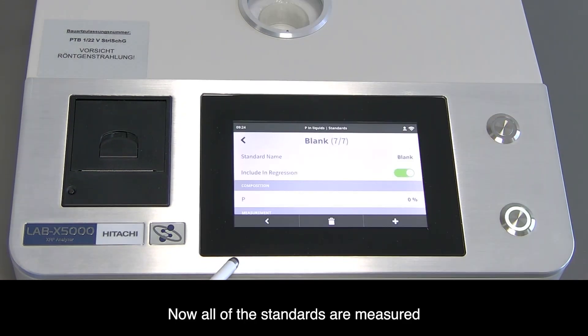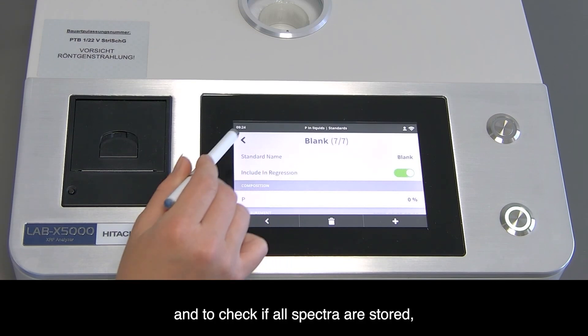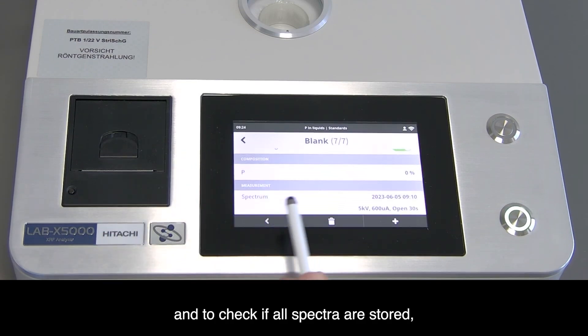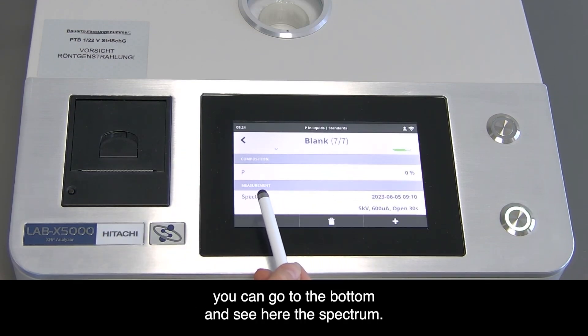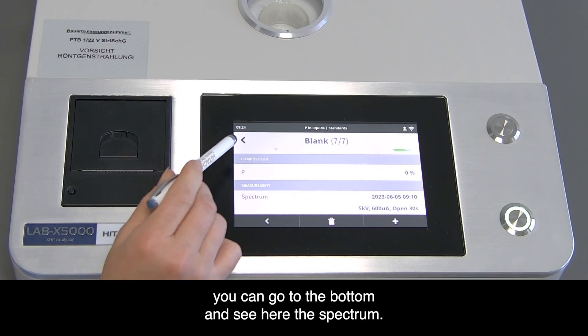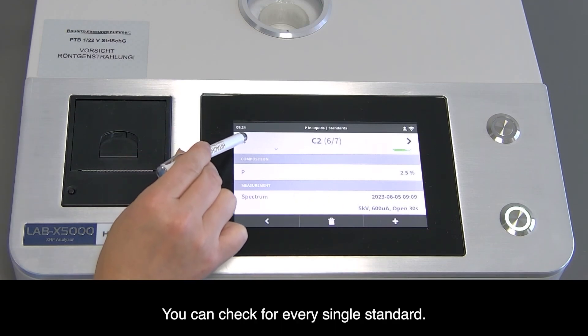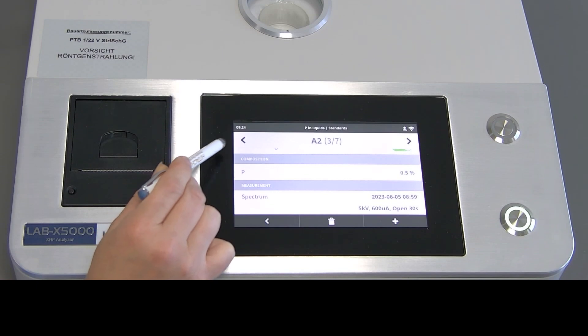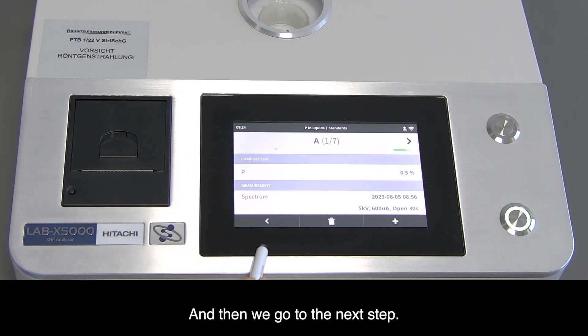Now all the standards are measured. To check if all spectra are stored, go to the bottom and see the spectrum - you can check for every single standard. Then we go to the next step.